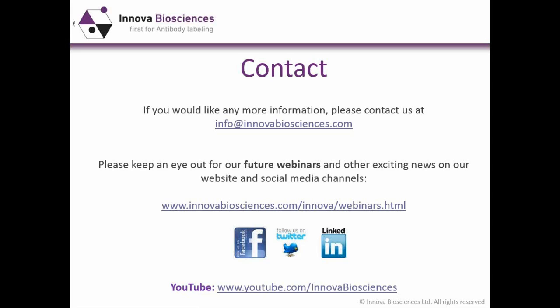In some ways, you could think of it as being similar to ion exchange chromatography. In hydrophobic interaction chromatography, proteins bind to a column in high salt conditions and tend to be released in lower salt conditions. It may be used to follow up with ammonium sulfate precipitation, as I mentioned right at the beginning of the webinar, as a second purification step after that stage.